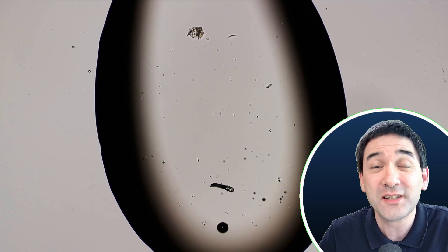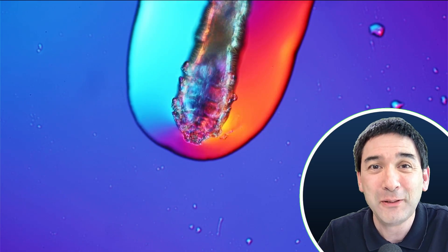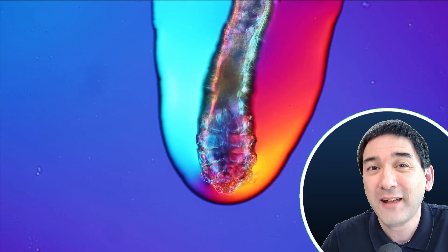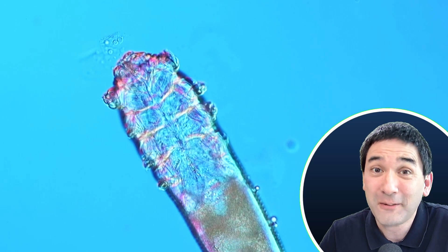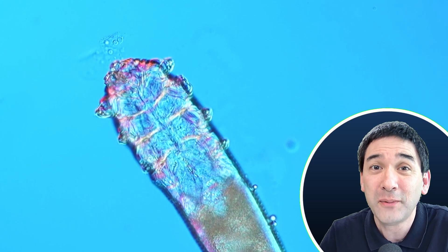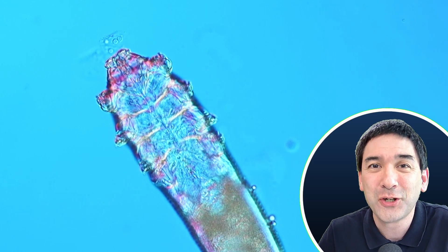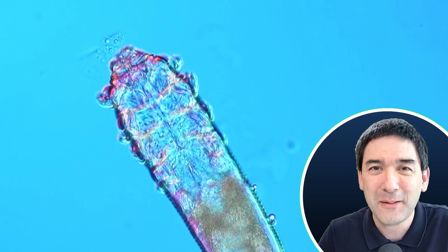What you see here is a facemite moving around on my microscope slide, and you can see that there is still a little bit of oil around the facemite — it's kind of pulling along the oil as well, so it's got quite a heavy load to carry here. That's pretty much it. What I would recommend: I've put a link into my Reddit page, and if you would like to share your facemite pictures with the community, please visit the page and share the pictures you've made. Happy microbe hunting — see you around next time. Bye bye.